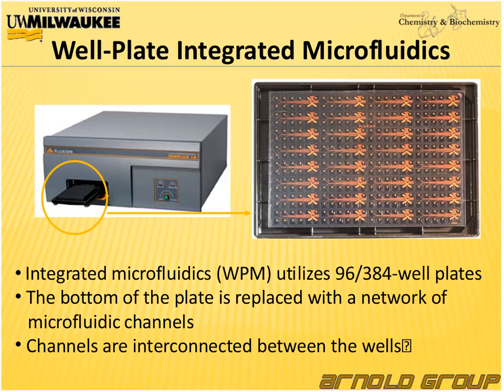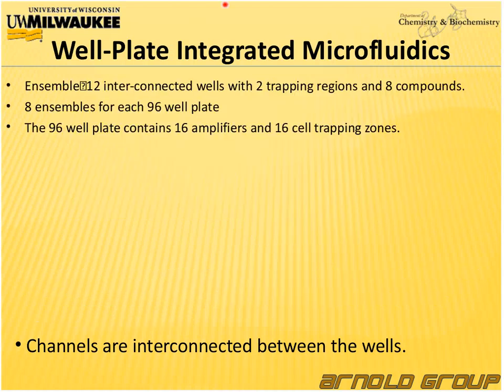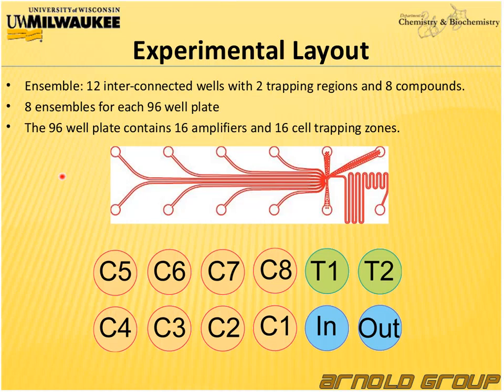So the important features of this instrument are that it's multi-well plate based, and so we have 96 or 384 well plates, which in the bottom are connected, I point this out here, through a microfluidic system. And this plate is divided into ensembles, and these ensembles, as depicted on this slide, consist of 12 interconnected wells, and these are the 12 wells over here. 8 of them are used in order to apply compound to the patch-clamped cells.